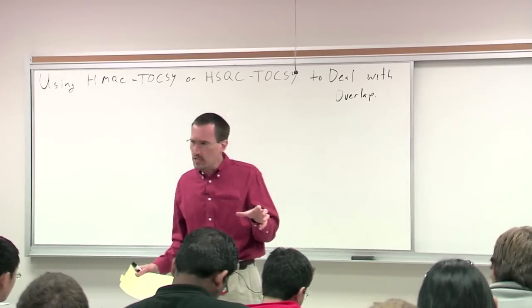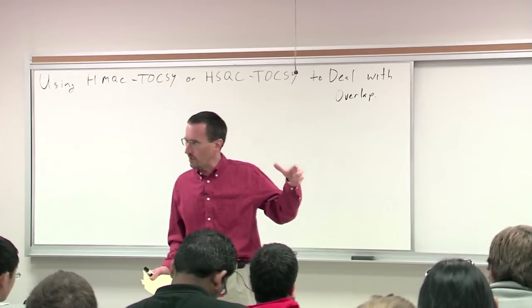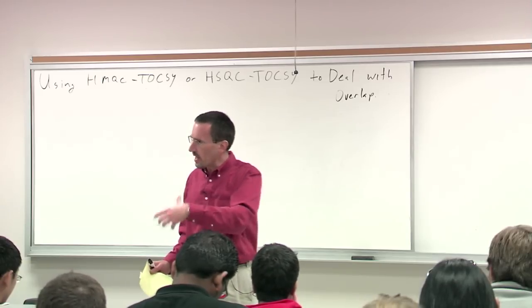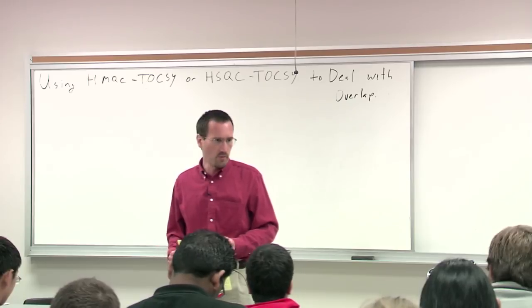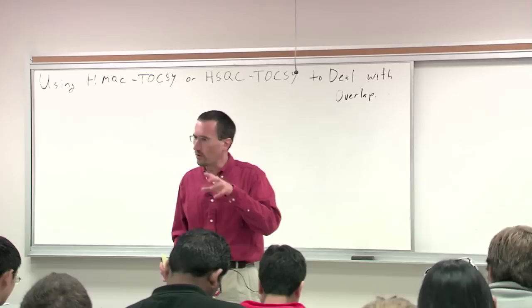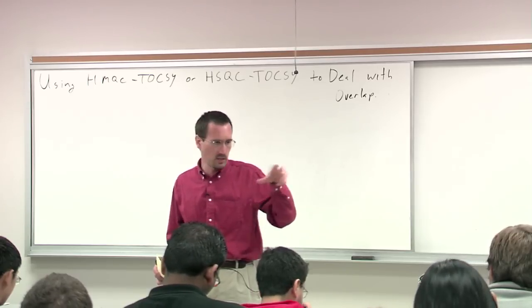And then we brought in HMBC, and we saw how HMBC can be really useful for putting the pieces together. And I talked about TOCSY, and then we had, for example, the Vail-Alla problem, where we saw how TOCSY could be really powerful for elucidating spin systems, because TOCSY can be like a super COSY.